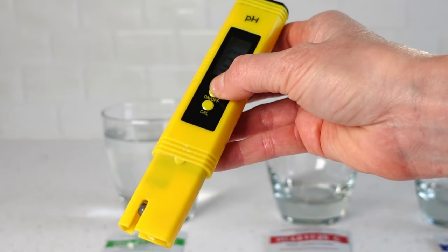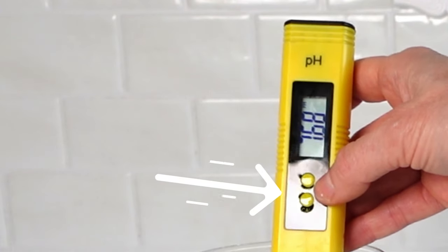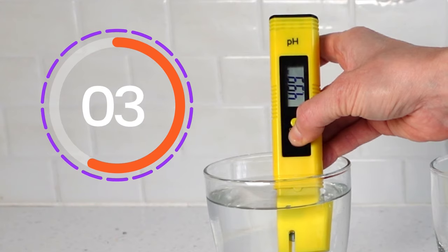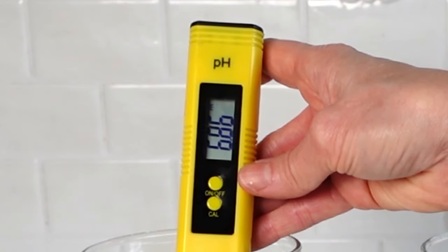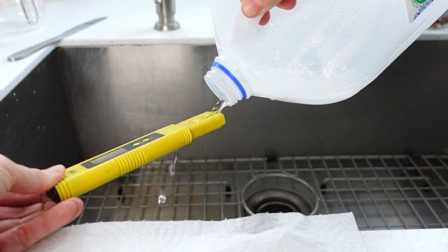Now it's time for the pH meter to be calibrated. The button pushing on the meter will be a little different with each glass or buffering solution, so be sure to watch these instructions all the way through. Turn the meter on by pushing the top button. Place it in the glass no further than the immersion line. Push the second lower button, which is the calibration button, and hold it down for five seconds. Release the button and wait for the meter to start and stop flashing. Calibration number one is now complete. You can leave the meter on or turn it off in between each of the three calibrations — it doesn't really matter.